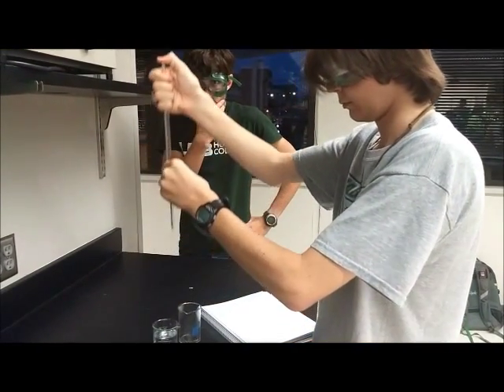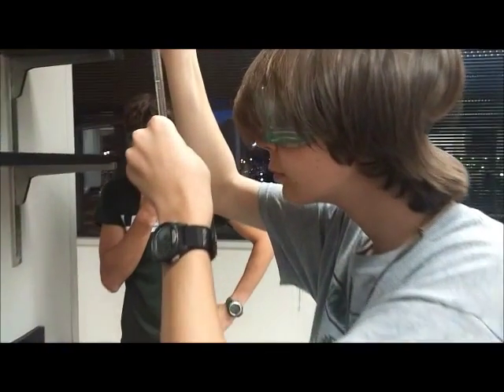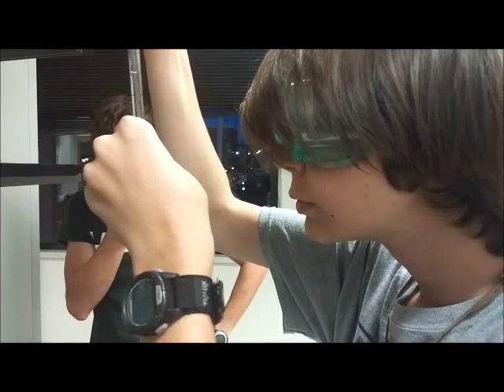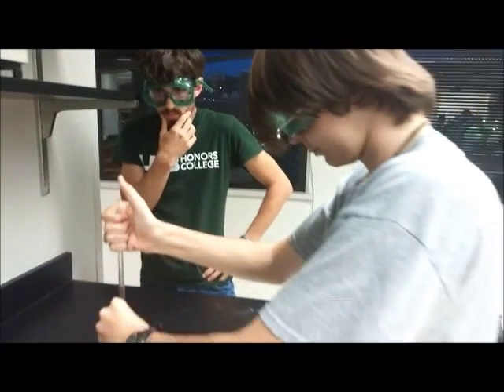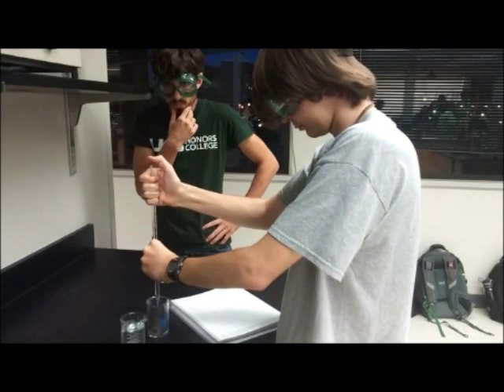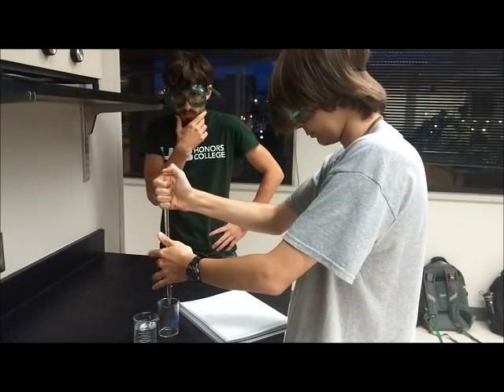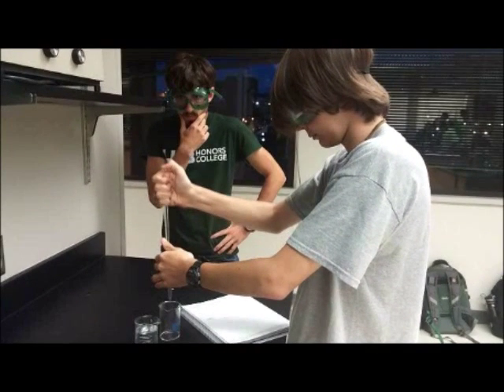Remove the pipette from the solution and record the initial level of the solution at the meniscus. Remove thumb to release some of the required amount of solution into the target vessel. Once enough has been released, stop the flow by putting your thumb back.